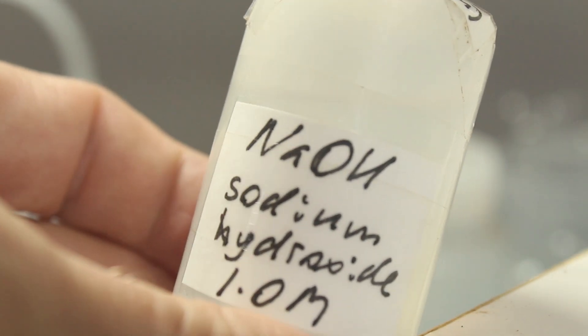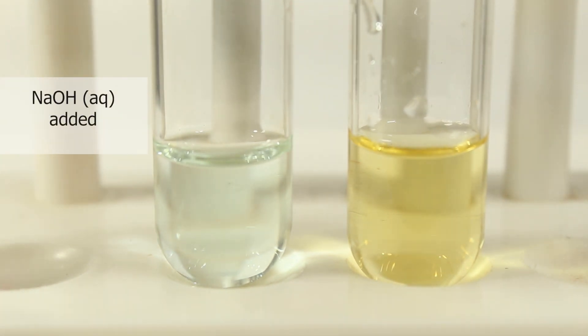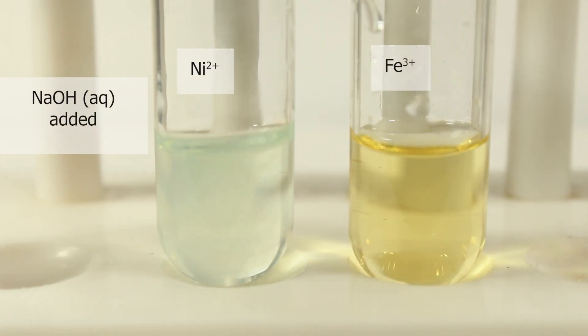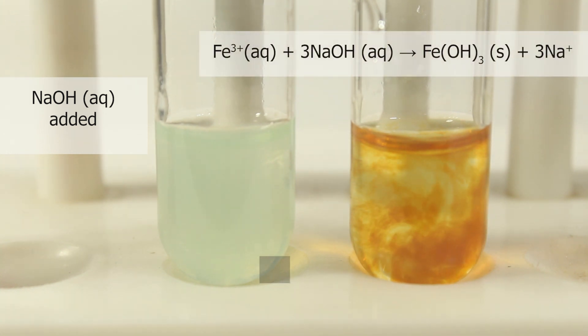Now sodium hydroxide. Precipitate supposed to be formed. First for nickel. So we expect something to happen. Yes, pale green precipitate. And now for iron-3. Our analytical test. Positive result for iron-3. Brown gelatinous precipitate of iron-3 hydroxide.